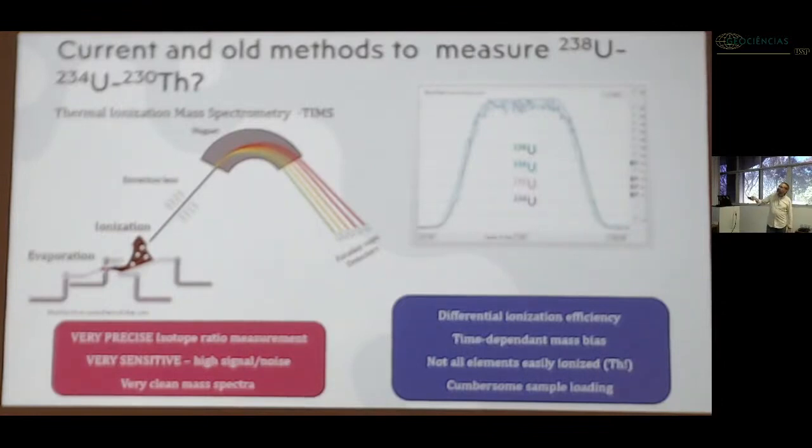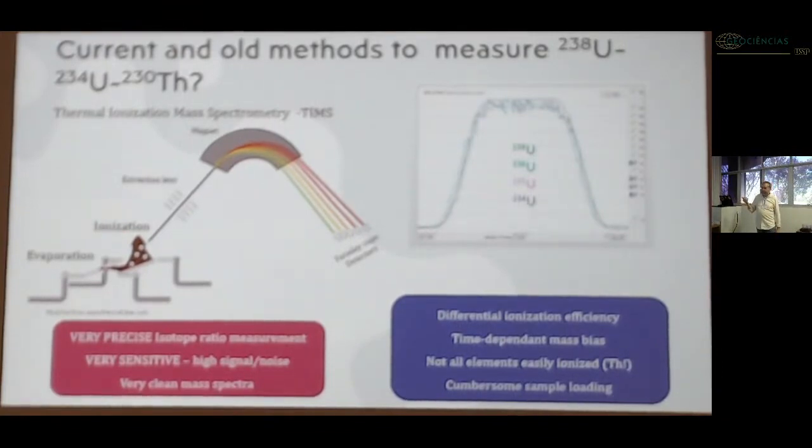And this ion cloud, there's a set of extraction lenses, and magnetic fields that are just pulling the ions into the mass spectrometer, and the magnet is actually separating the ions. Usually the lighter ions have less momentum, so they are easier to deflect and change direction, while heavy ions have more momentum, and therefore are more difficult to deflect, and therefore you can separate heavy from light ions.